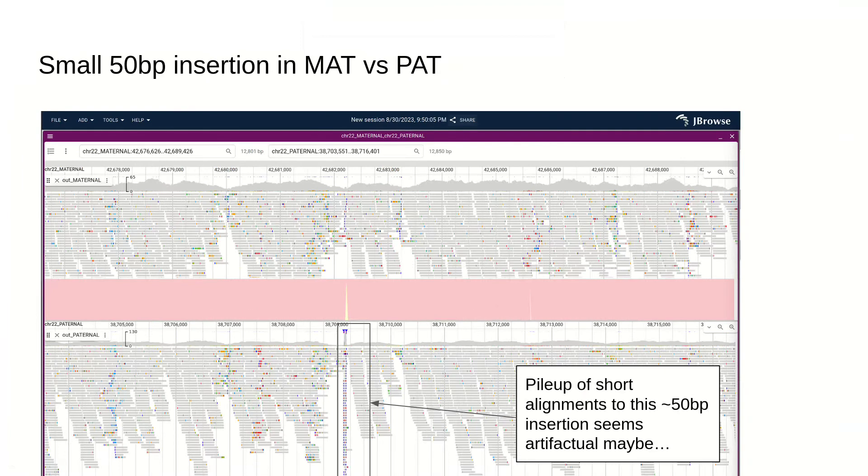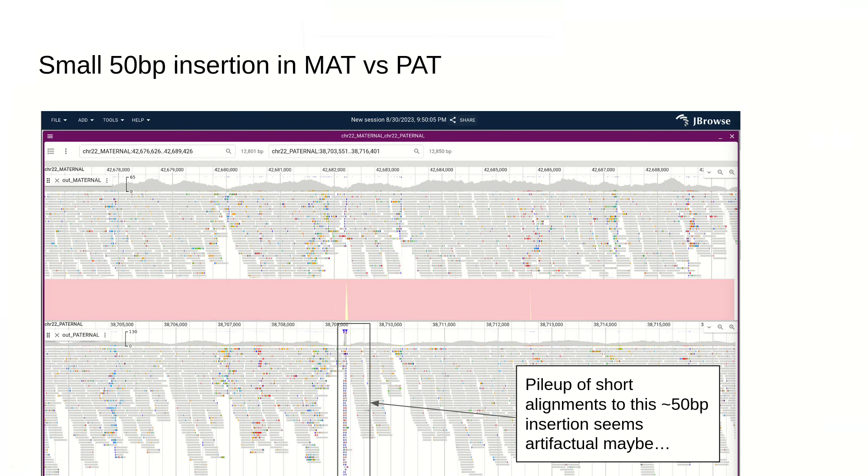There's also the ability to investigate even small types of variants. I used Minimap2 to align the maternal versus the paternal assembly and outputted the CIGAR string. This allows us to get per base information about that whole genome alignment. In this case, we can see there's about a 50 base pair insertion on the paternal genome compared to the maternal genome. When you align reads here, there are an excess number of reads piled up here, even though they have a weird clipping pattern which I have yet to investigate.